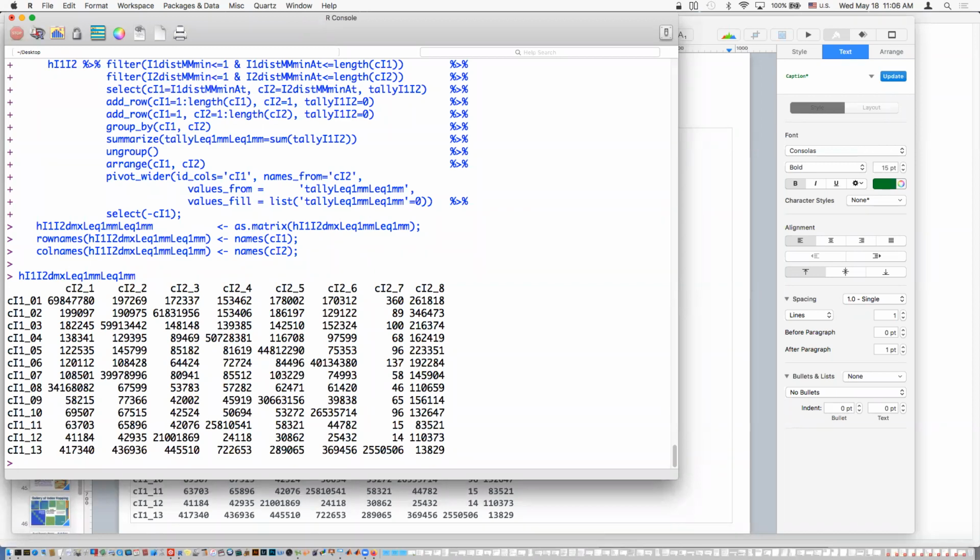So these are all our canonical I1 targets, all of our canonical I2 targets, and under a less than equal to 1 mismatch, less than equal to 1 mismatch, Demux analysis, how many reads do we get?